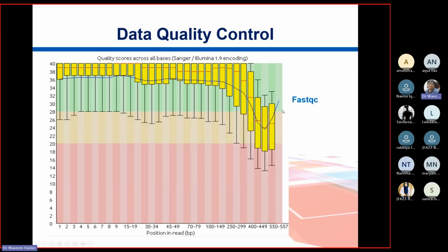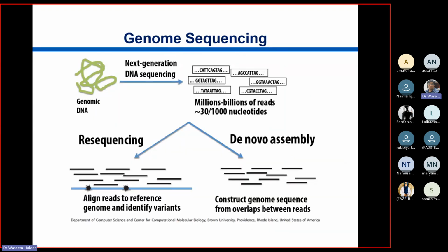All boxes in the green zone mean that it is of good quality, minimum 28, or let's suppose 26. Some are in the acceptable region, the yellow one. Red one is where you should be cautious, right? So here some of them range from as low as 14 or 12 and as high as 32. So we are probably going to use trimmers or clippers for them, different tools which are there in that FastQC thing.